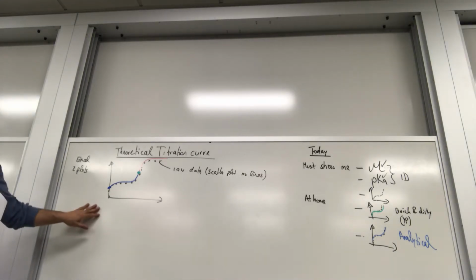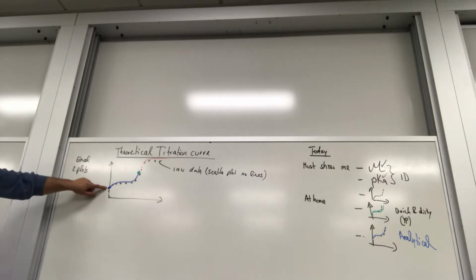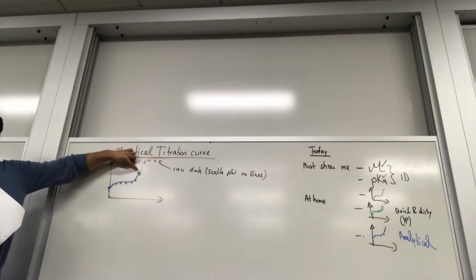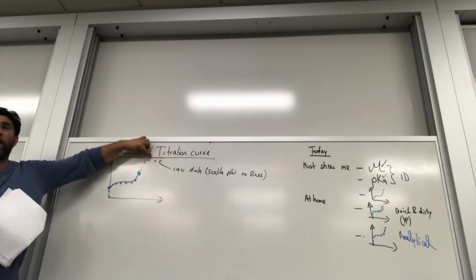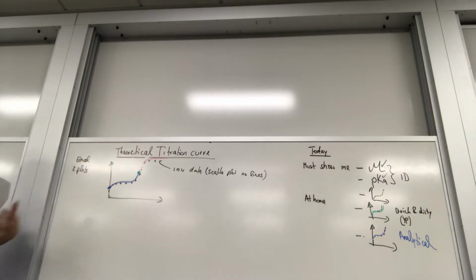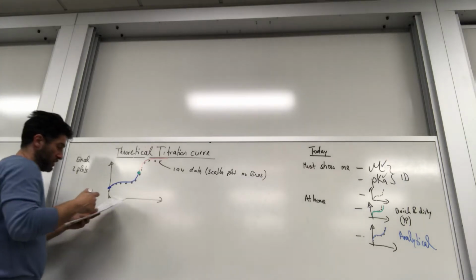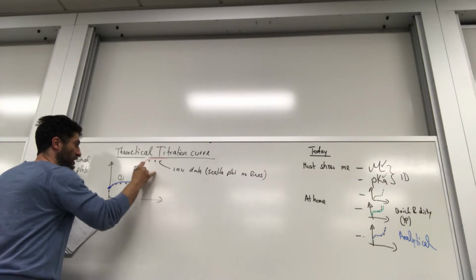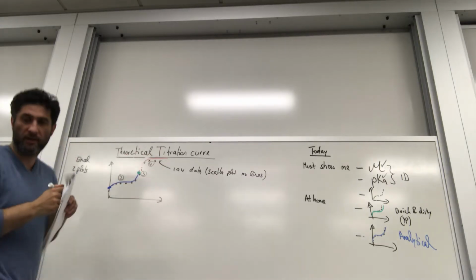Now, what is special about this graph? Well, depending on where you are, in the buffer region, blue, at equivalence point, green, or in region 4, where it's basic, I need Excel data that you calculated. Well, how do you calculate this? So this is region 2, 3, 4. How do you calculate this data?